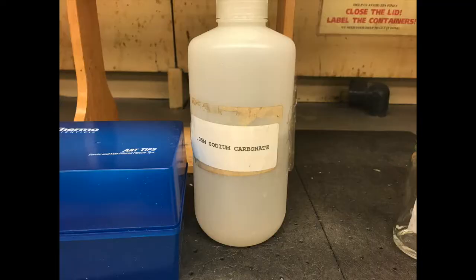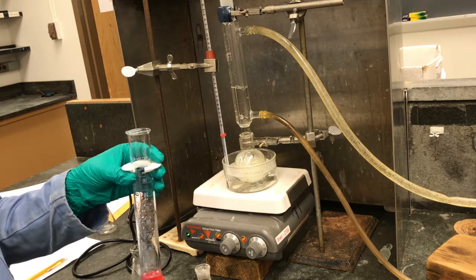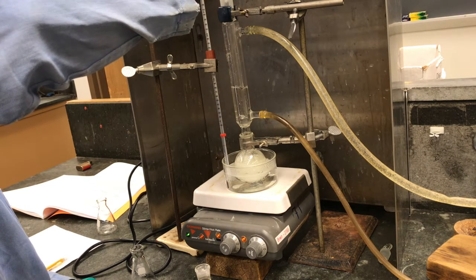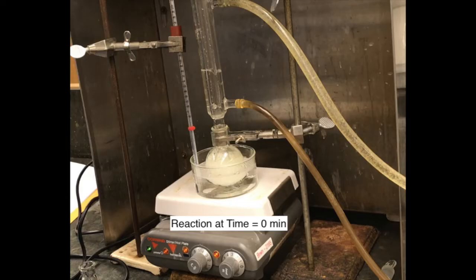The last thing we need to add for the reaction to begin is the sodium carbonate. You can see the concentration of the reagent bottle that we used. And we're adding about 20.3 milliliters of this solution. So as soon as we added the sodium carbonate solution, that was our zero time point for the reaction. You can see what it looks like at the beginning. And then we'll show you some slides so you can compare what it looks like every 15 minutes that it's been going through reflux.